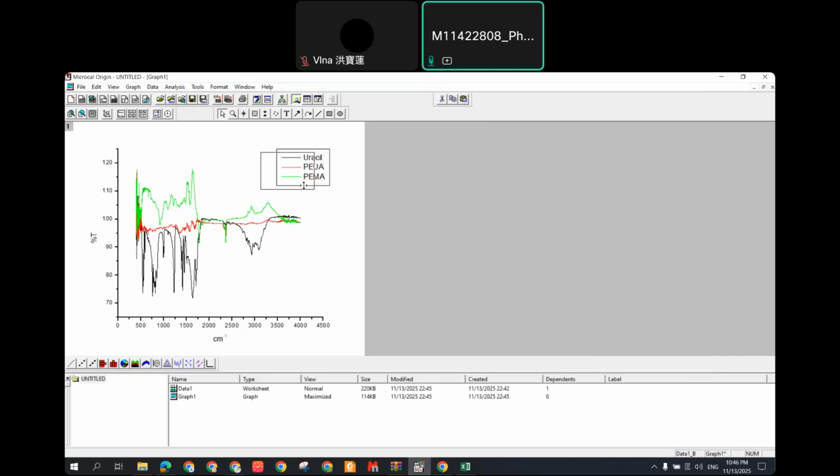Okay. So we usually do the graphic to have some closed bar here, so it becomes a rectangle. How to make this line? Do you know?